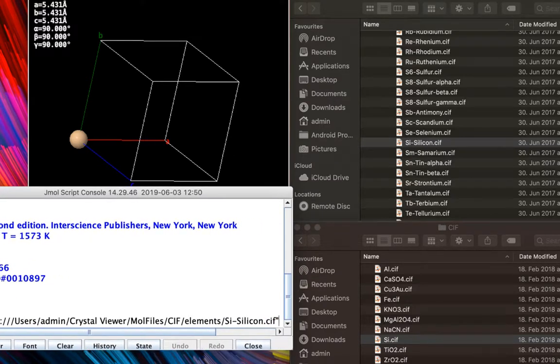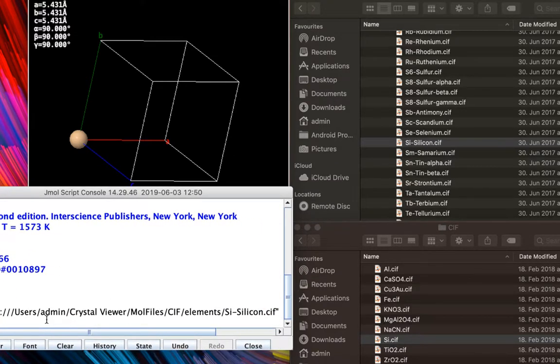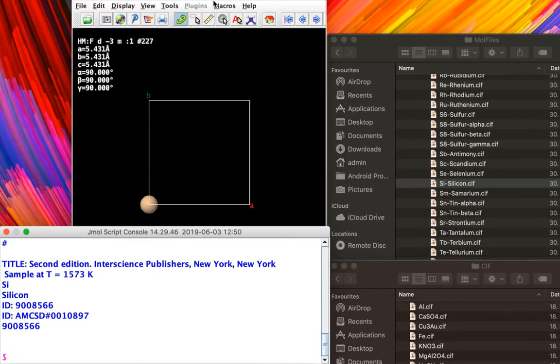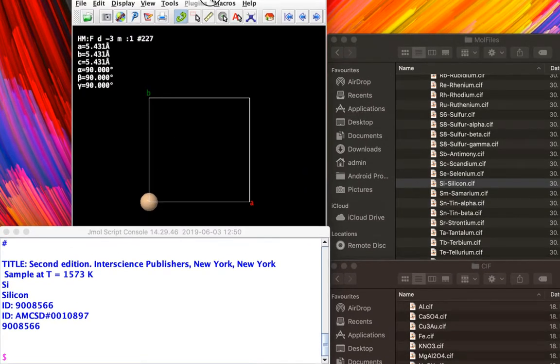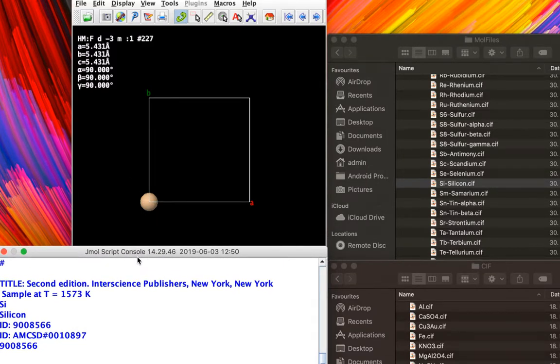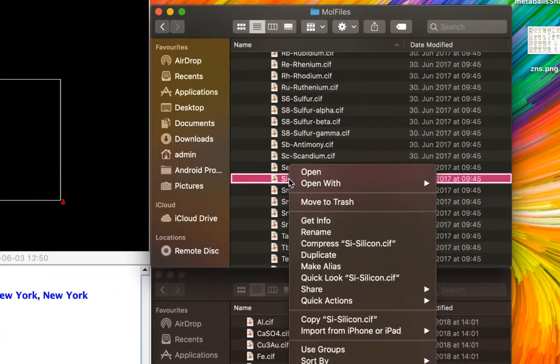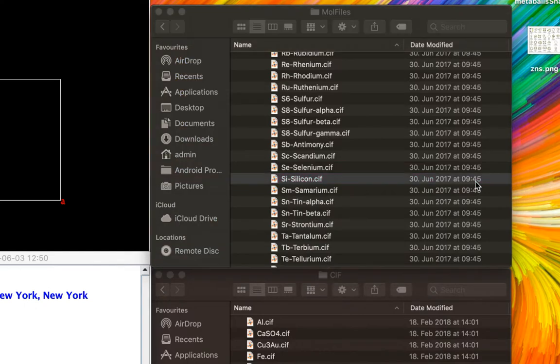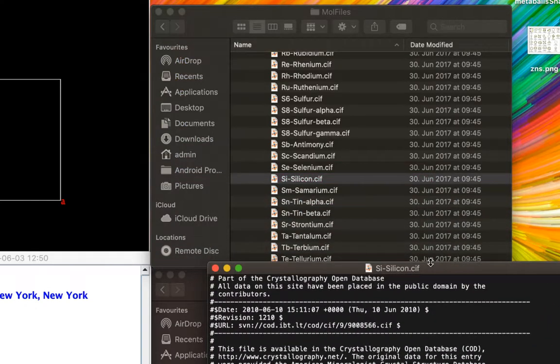Now we'll try to understand how and why Jmol works the way it does. Go ahead and hit Enter, and once again you'll notice it only visualizes a single atom, but it is able to read the crystallographic information correctly. The reason it is visualizing only a single atom is pretty simple.